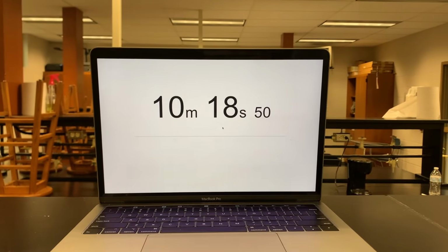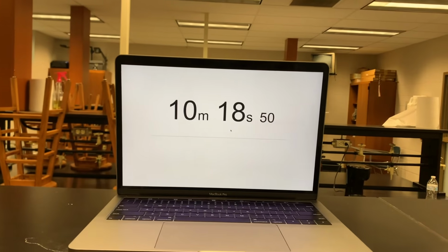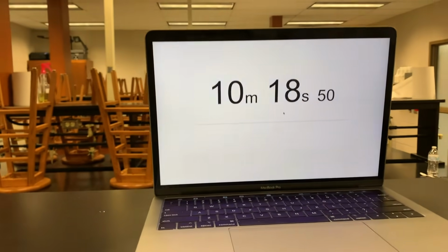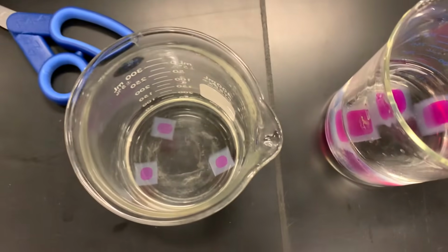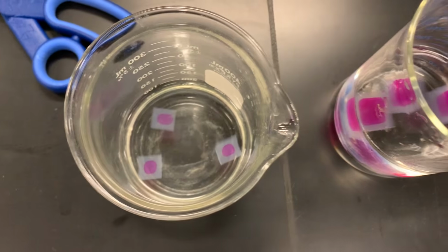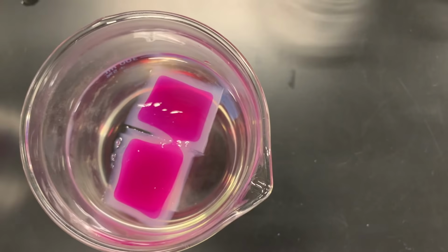Okay, so some time has passed. I gave it about 10.5 minutes, close to there, guys. Only reason I did that was so that we could see some pretty good results with respect to our diffusion. So we have our 1 centimeter cubes, our 2 centimeter cubes, and then we have our 3 centimeter cubes.